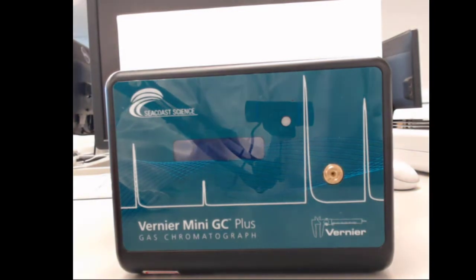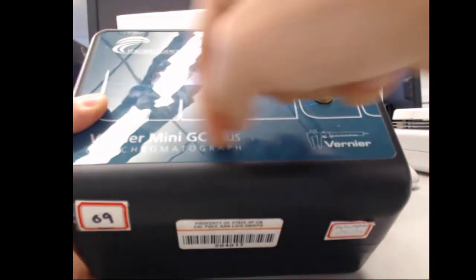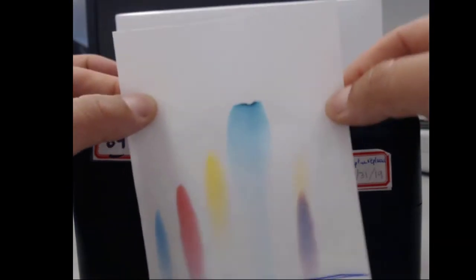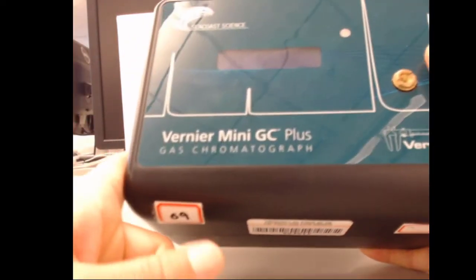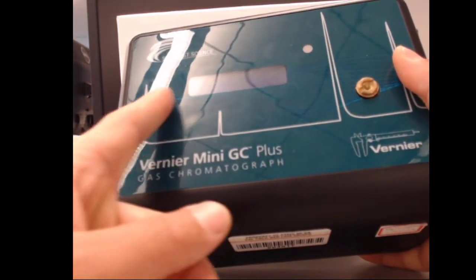And we'll look at that. Gas chromatography, it turns out, is pretty similar to paper chromatography in that inside here there is a giant coil that kind of runs around and around and around, and it's chemically treated to act like a stationary phase, to act like the piece of paper. And then we inject a sample, it pulls air into it, and the air getting blown through the coil acts as the mobile phase. There's a detector at one end that can then tell us when a chemical compound goes by and what kind of signal is generated.